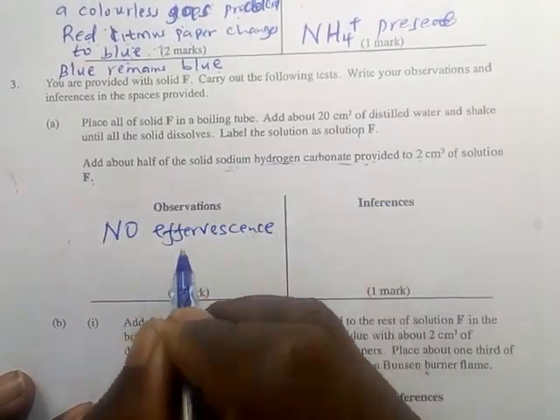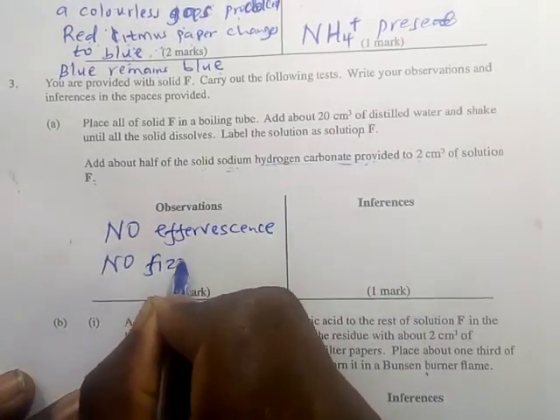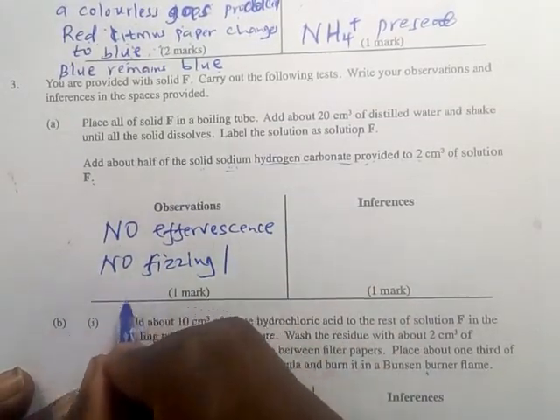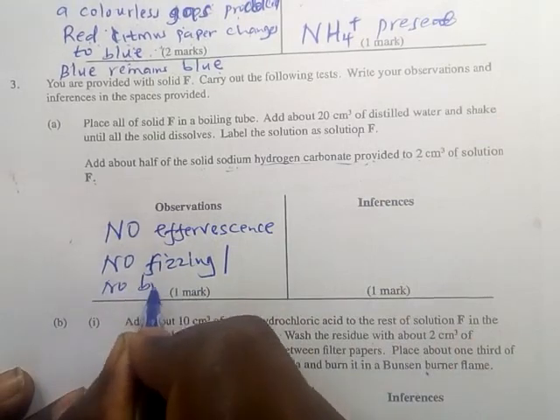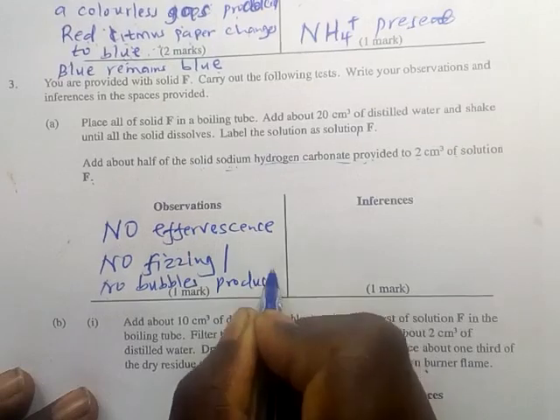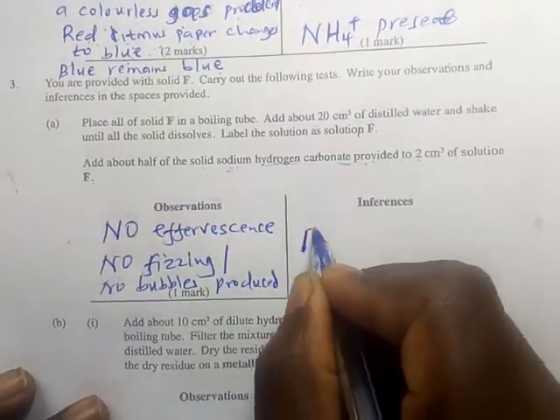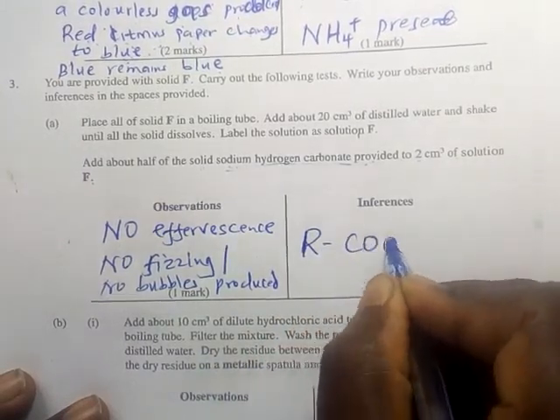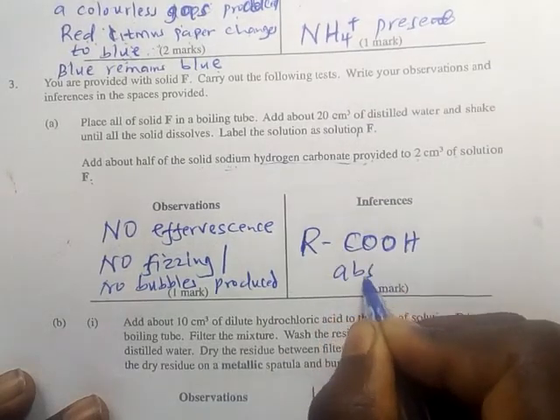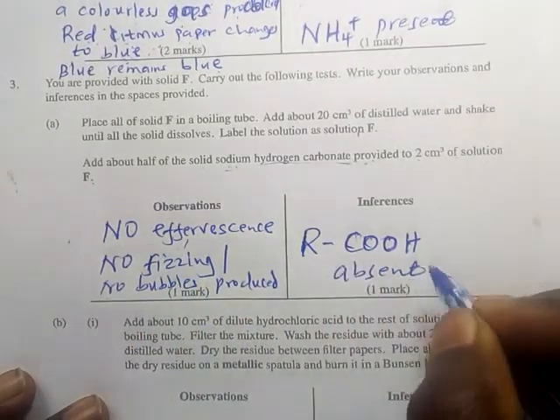If the word effervescence becomes difficult for you to write, write no fizzing. If fizzing is difficult, write no bubbles produced. So if that happens, it simply tells you that the organic acids, alkanoic acids, are absent. No effervescence, it is the alkanoic acid which is absent.